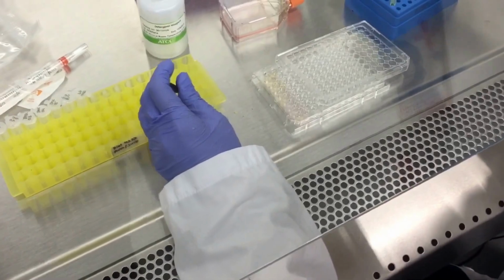And after you finish putting in your MTT, you would put it back into the incubator for 2 hours.